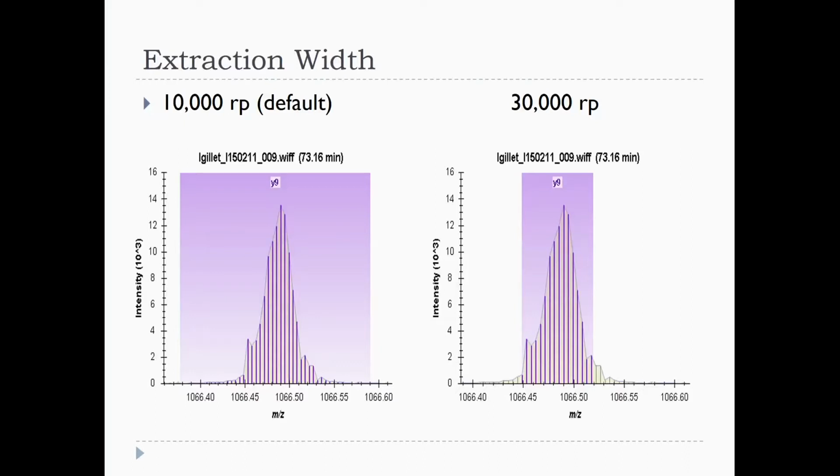And to Pedro's credit, he said it was the default. Ludovic ran the instrument, and he was asking me what settings he should use. I thought he had some foreknowledge, and that resulted in a bad setting.